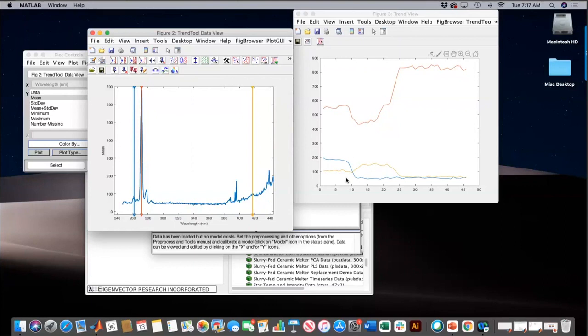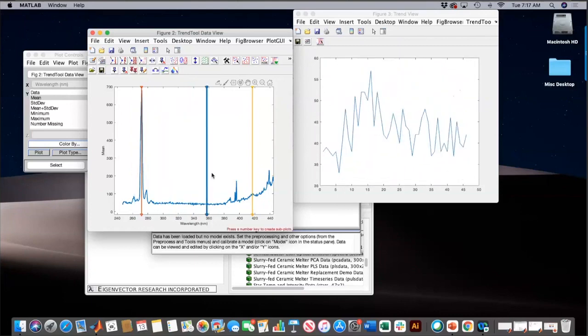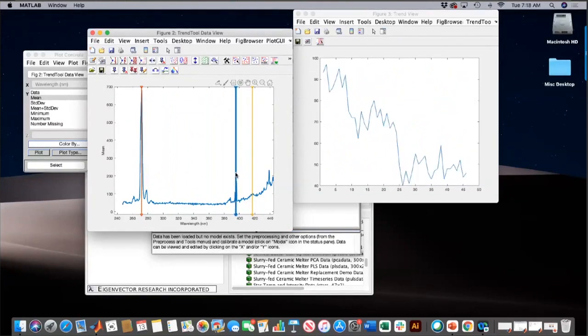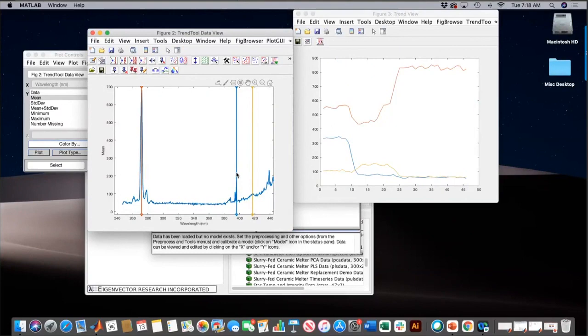How would I make these a little clearer? Well, let's instead do some integration of areas here. And in fact, rather than look at this aluminum, I know for a fact that these two peaks right here that I'm going back and forth over are an aluminum doublet. And in fact, when I'm on one of them right there, I can see it. And so that's this blue one right here, pretty classic aluminum.